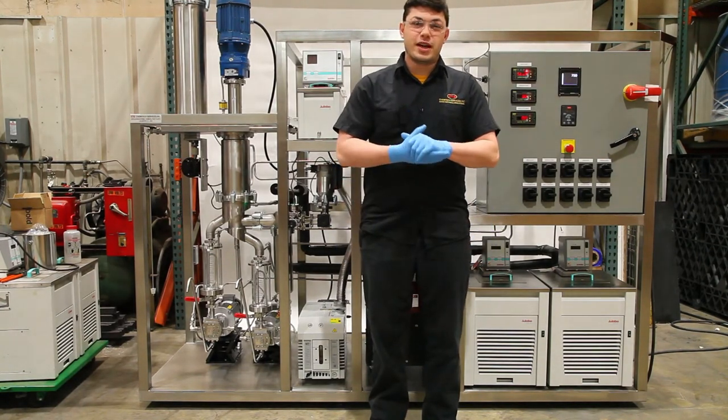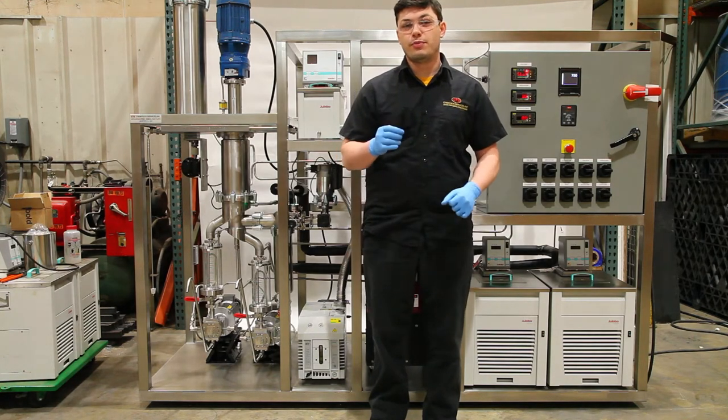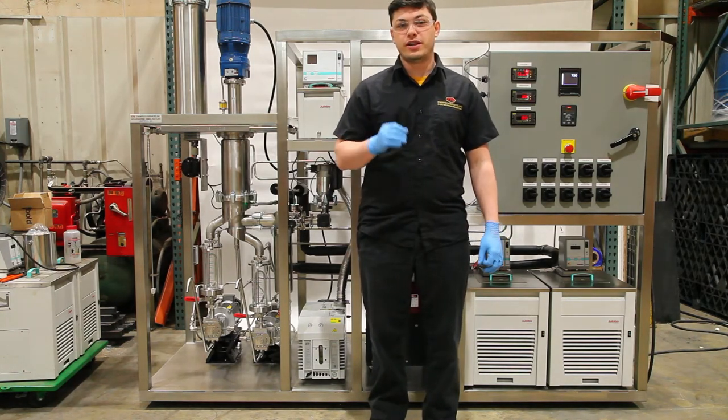Hello, Eric Rosner from Chemtech Services Incorporated. Today I'm going to show you how to start up and shut down our turbulent molecular booster pump.